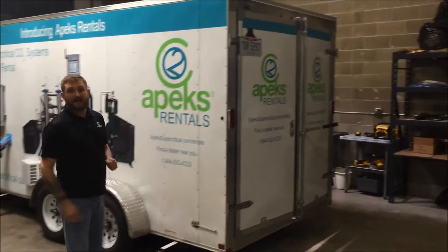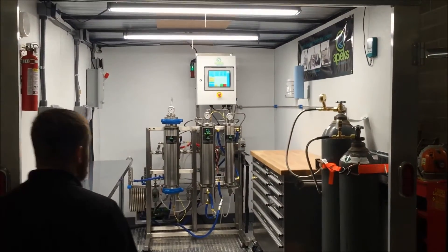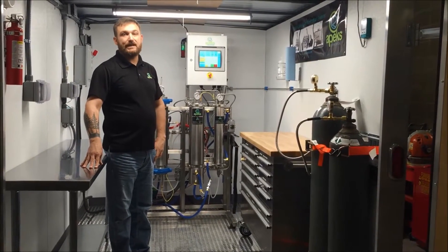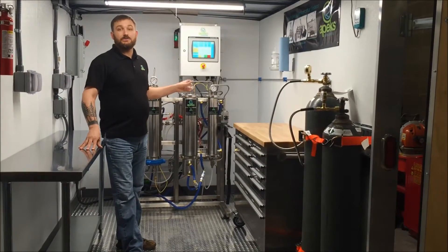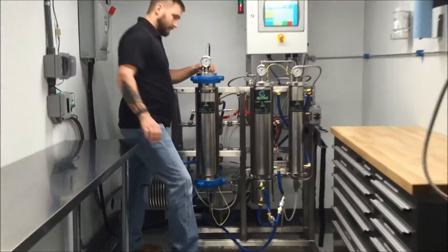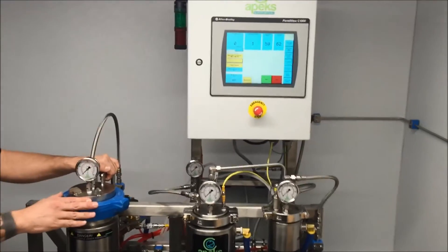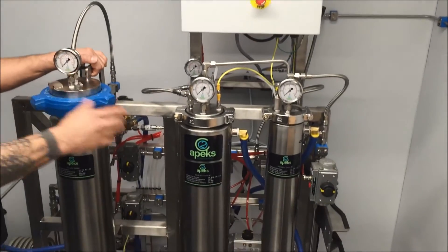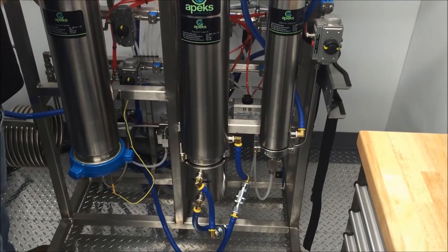Let's take a look over here to see what we have inside. In here we have our Apex Supercritical 2,000 PSI 5-liter diaphragm pumping system — this is Apex's most reliable system on the market today. Come on in. Right here is the 5-liter extraction vessel, which will hold three to four pounds of ground up dried plant material. This system works the same way as all the other Apex systems: you hit start, enter time, temperature, and pressure, it'll ask you to check a few things, then off it goes.